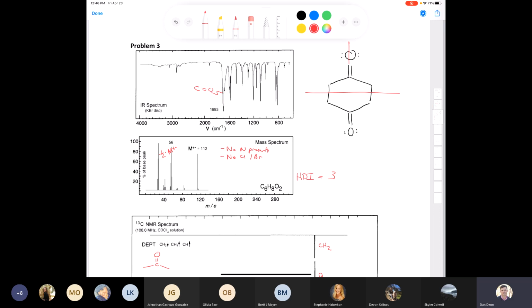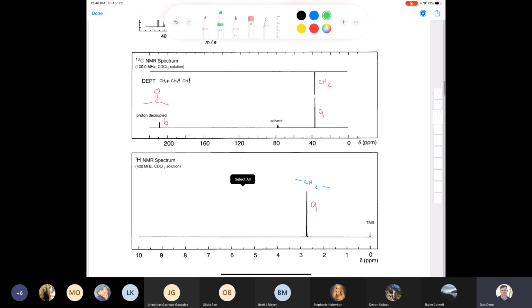Well, you can see that we've got reflectional symmetry here, and we have reflectional symmetry here. Therefore, just with respect to our carbon-13, each one of these carbons that I'm highlighting in yellow is chemically equivalent. And also, our 2 carbonyl carbons are chemically equivalent. That explains why we have only 2 signals in our carbon-13 spectrum.